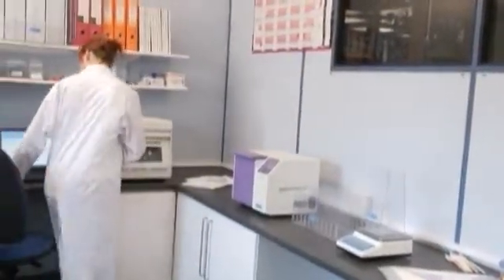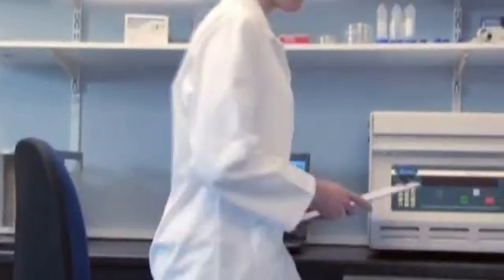Seward, with offices in the UK and North America, are manufacturers of the one and only Stomacher Laboratory Blender.